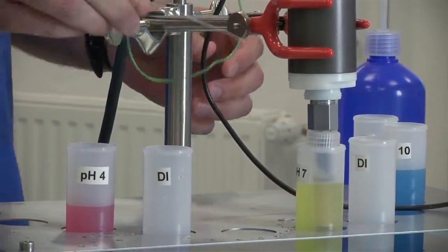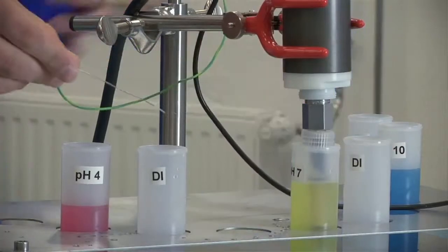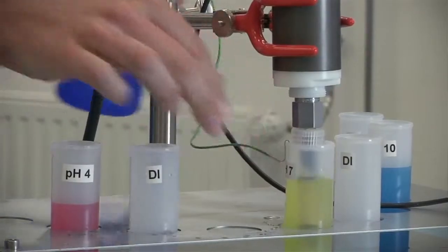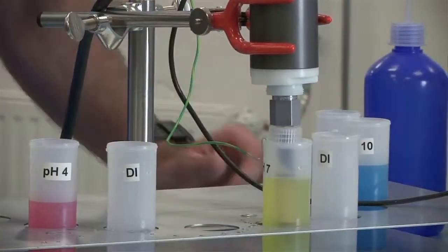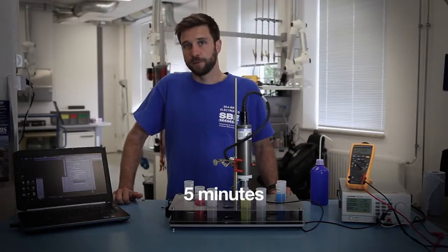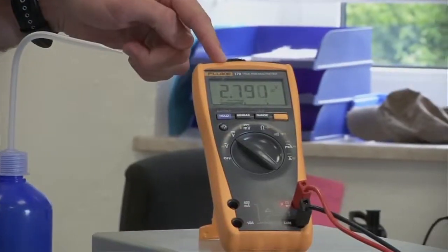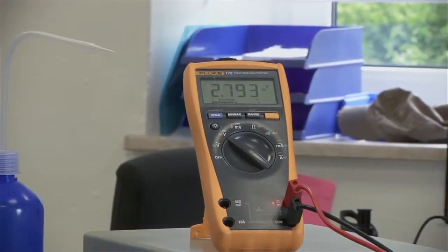And again use the ground strap in the next solution as well. So then again we'll wait a few minutes for it to stabilize and record the voltage out for the pH of 7. In this case 2.797.